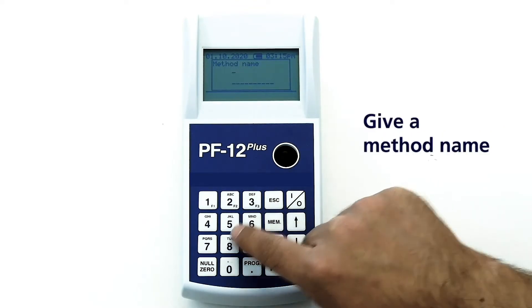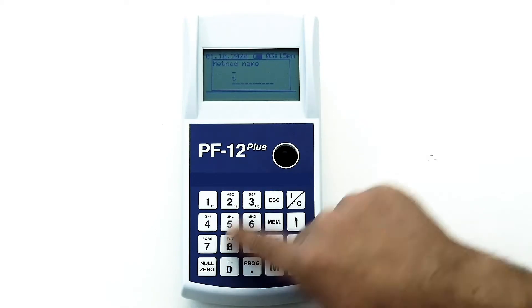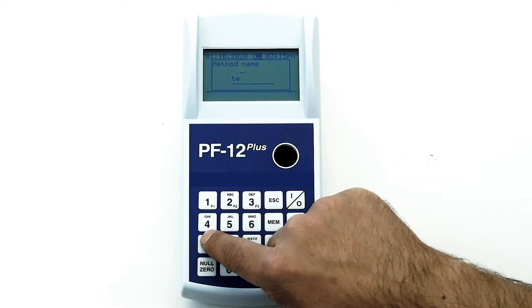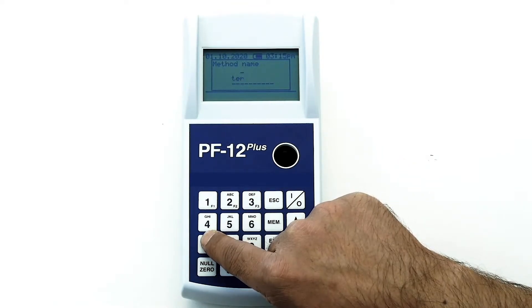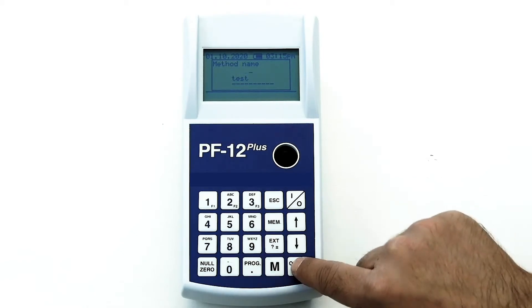Now give a method name. You can choose any name you want. For example, for this method we will write test. Press OK.